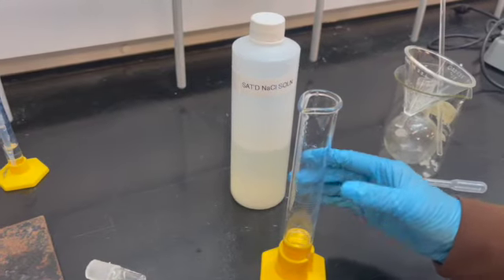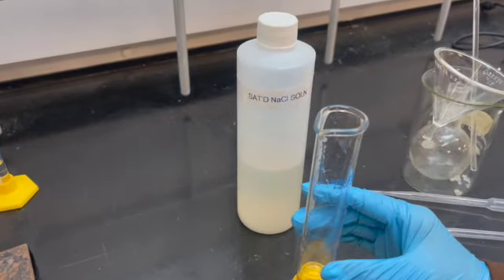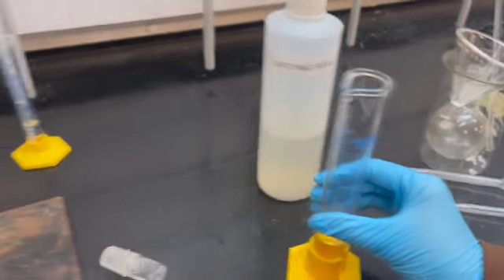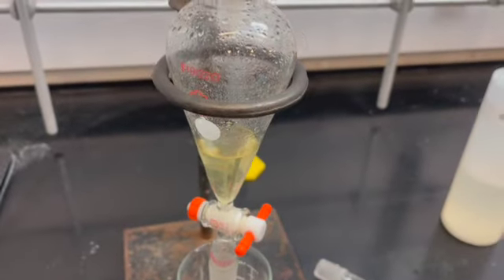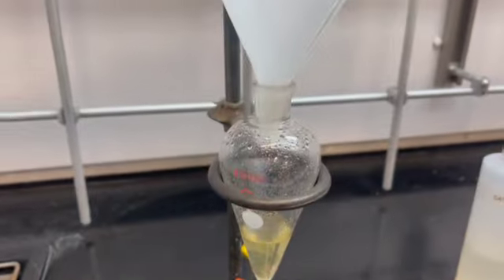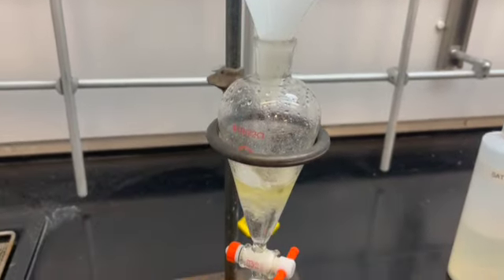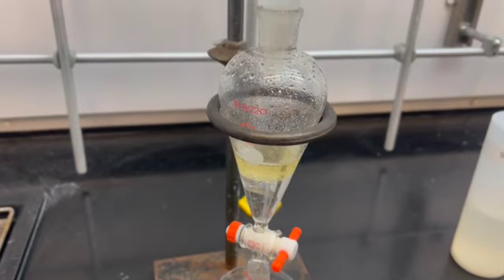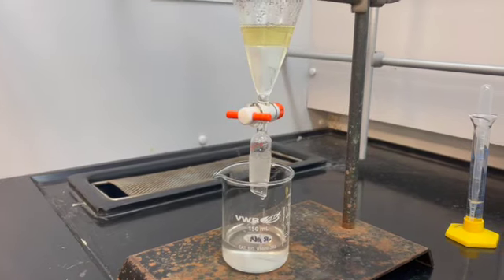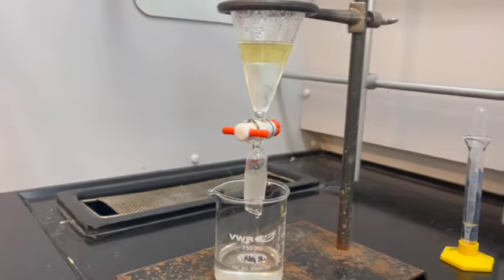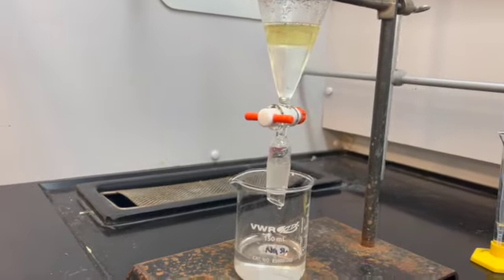We are going to add 15 milliliters of saturated NaCl solution into our separatory funnel, which then we will mix, open, mix, open, mix, open. Now we are going to start separating our organic layer from the saturated NaCl solution.